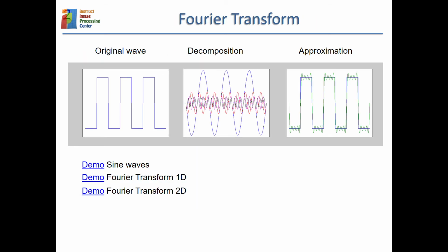So here is where we see Fourier. Fourier is another family of operations that we can do on our images. What we have seen so far are operations at the level of the full matrix, operations at the level of a single pixel, and operations at the level of groups of pixels. The Fourier transform is again operating on the whole image. So it is transforming the way we interpret images.